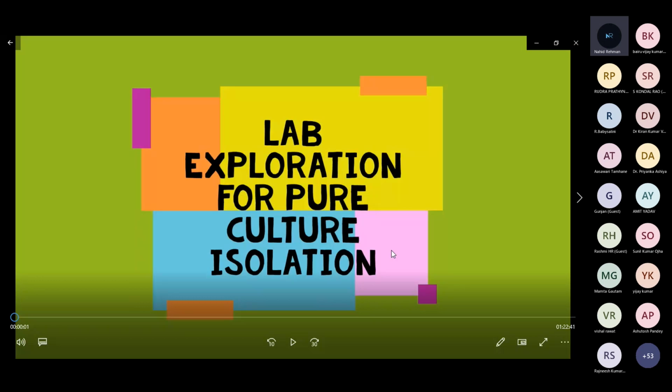Reason being is that you will come to know how these microbial sources can be used for conversion, and what would be the yield, what would be the production rate, as well as what would be the substrate conversion rate. To understand what the substrate is: substrate is your complex waste. Why am I saying it is a complex waste? Because it may contain different biomolecules in their polymeric form, which could be carbohydrates, proteins, or lipids, along with that, definitely the vitamins as well.